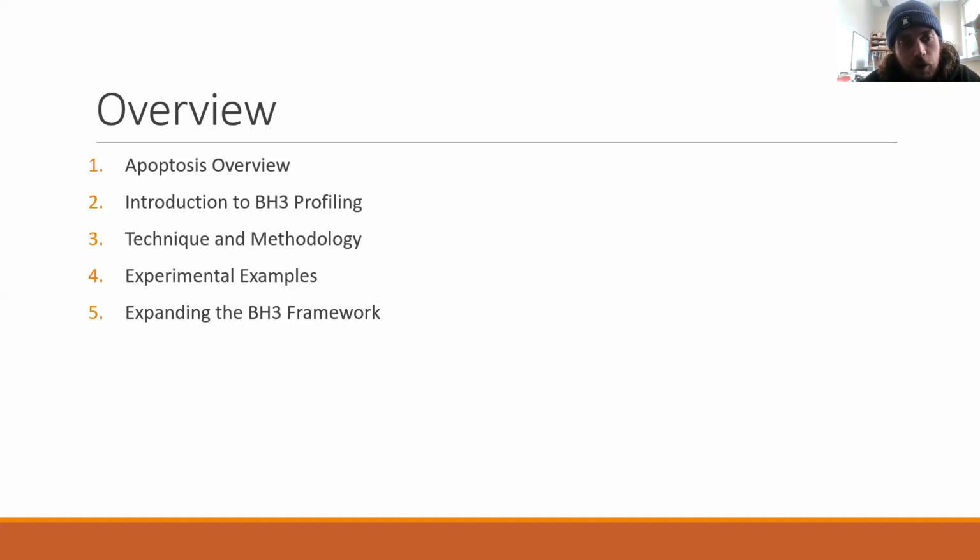But in brief, I'll be giving an overview of apoptosis, an introduction to the methodology, how the technique is run, and some experimental examples from previous papers and of my own work, and then talk a little bit about how the BH3 framework could potentially be utilized by you guys in your research, and how the initial idea and concept can be expanded outside of maybe just a flow cytometry protocol.